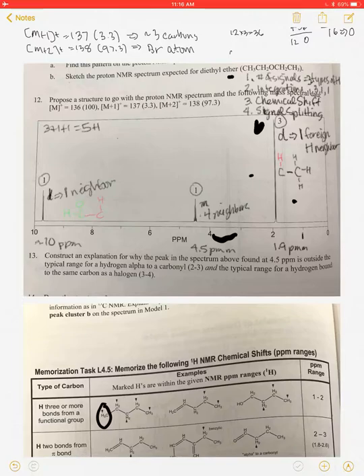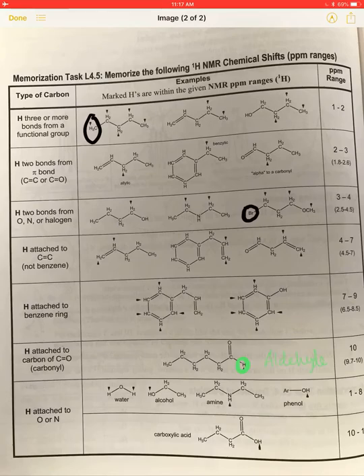So it's shifting it past the 3 to 4 that we'd expect, closer to 5. Well, we do have another functional group on this molecule besides the bromine. We've got the C double bond O. So if we look at our memorization task for a C double bond O, if you look at 2 to 3, there's hydrogens that are alpha to the carbonyl.